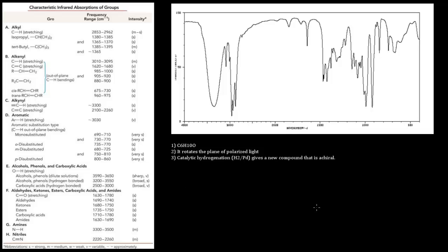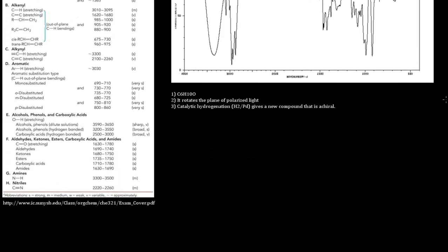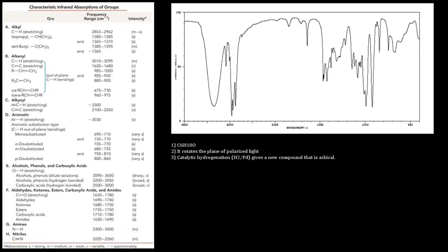Let's start with the oxygen. We know it can't be an ester or carboxylic acid, so it must be a carbonyl, alcohol, or ether. To check for a carbonyl, we look at the frequency range of about 1630 to 1780 cm⁻¹. Going to that region in the infrared spectrum, we notice there's nothing really there — and a carbonyl requires a strong stretch. There is no strong stretch in the 1630 to 1780 region, so it cannot be a carbonyl.